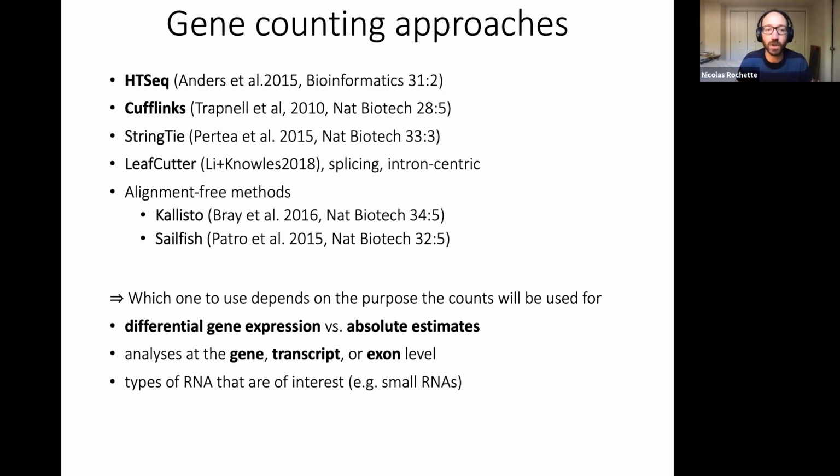This is not relevant in some cases. Some genes are going to have alternative transcripts, and those transcripts may make a big difference in terms of the functional consequences of the expression of that gene. So in some cases, transcript level analyses are going to be more relevant or more precise.